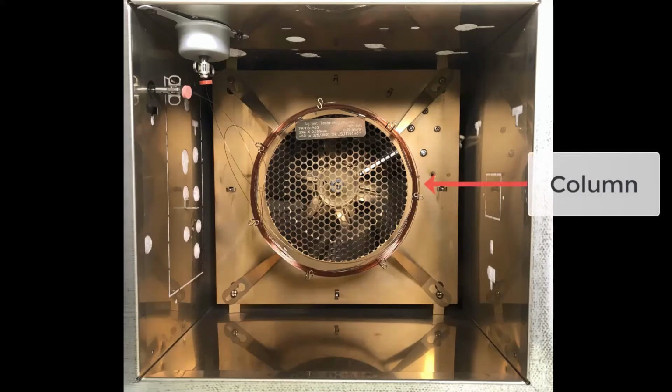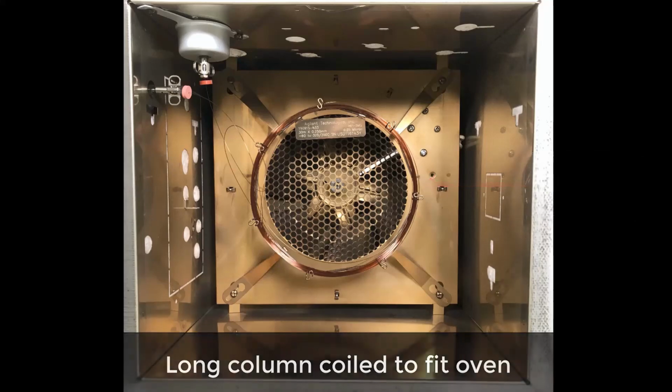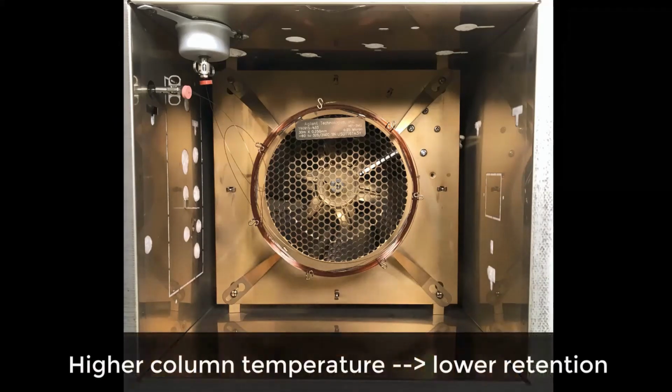Columns in GC are typically open tubular columns that have an inert gas as the mobile phase and a bound liquid as the stationary phase. The column stationary phase dictates selectivity. Temperature can also affect elution time. We can alter the time molecules take to elute by altering the temperature or creating a temperature program.